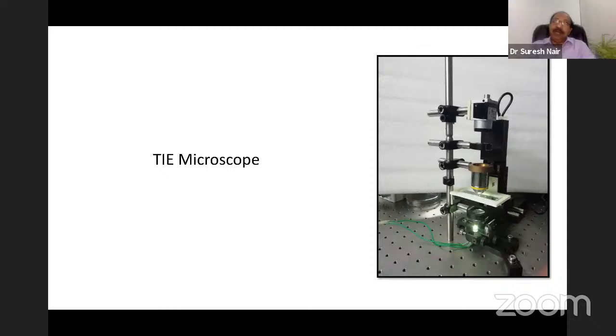Is it possible? I think it may not be possible, right? Because we don't want to take out the sample in situ. If you want to just look at it, is it possible? Yeah. In situ, we can do up to 5 micron, or 5 to 8 micron.